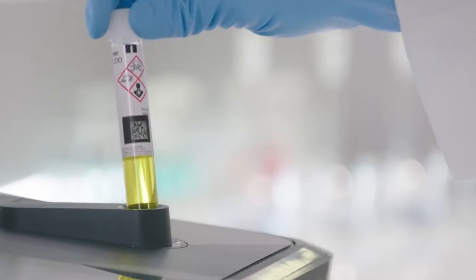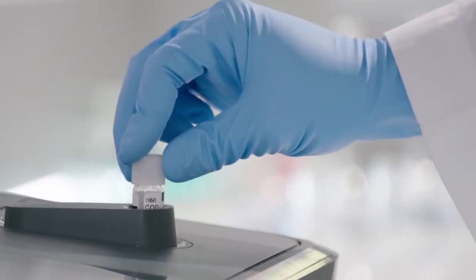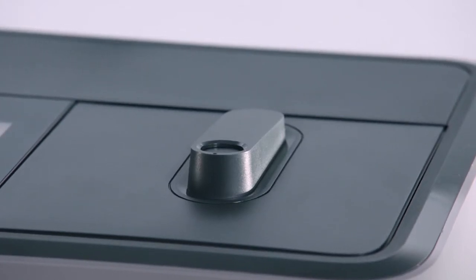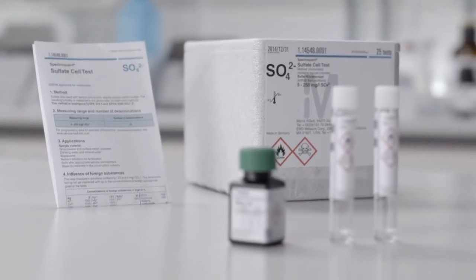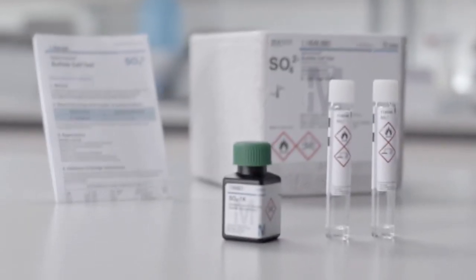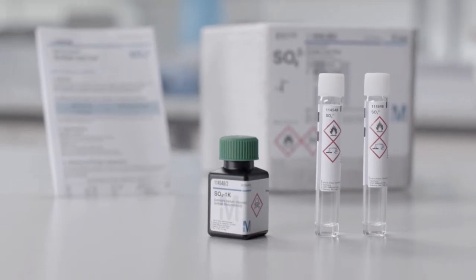If you use our SpectraQuant cell test kits, you can insert the round cell directly into the cell port. These kits contain virtually all reagents necessary for the analysis.